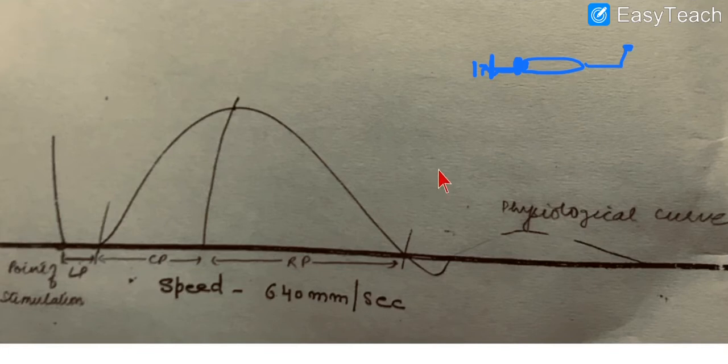And once it becomes mobile, to make it stationary again obviously takes some effort. Because of that momentum, we will get one graph that is not because of the contraction of the muscle, and this part is called the physiological curve. That is another point.